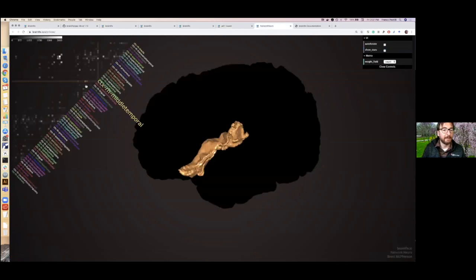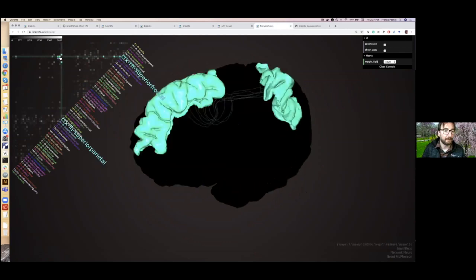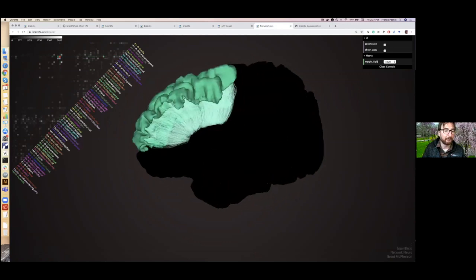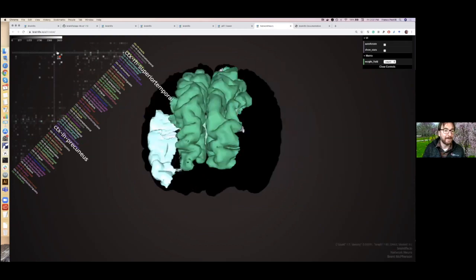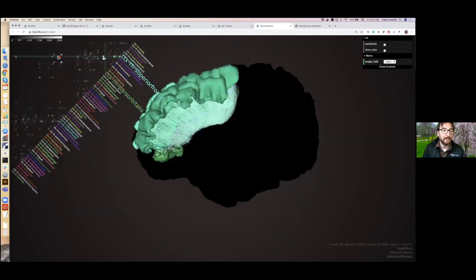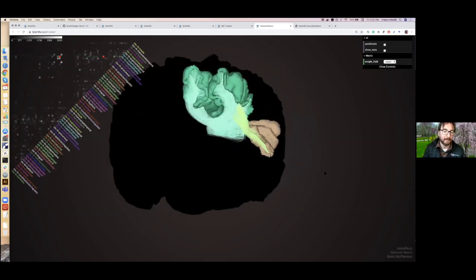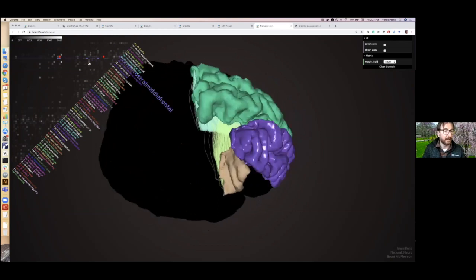Another type of visualization is about networks. We're working a lot around networks recently, especially because we got this new grant funded. Here, for example, it's a quite unique type of visualization where you can see at the same time, on one side, the matrix of connectivity, and on the other side, the anatomy that underlies that matrix of connectivity. This is also beta. We're not quite funded for this, but we've been having fun developing it, hoping to do as much as we can soon.